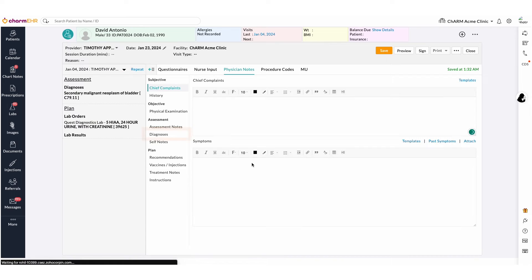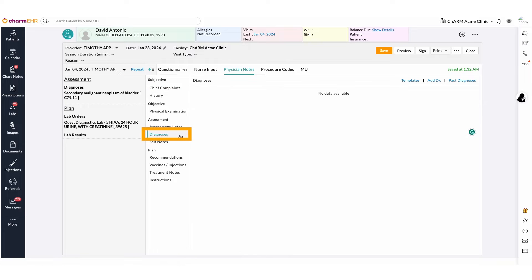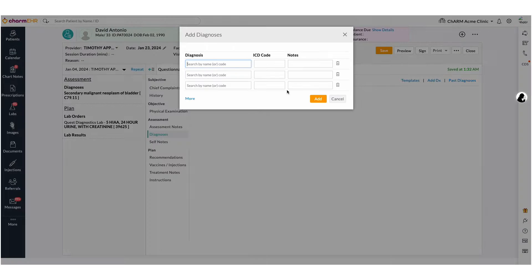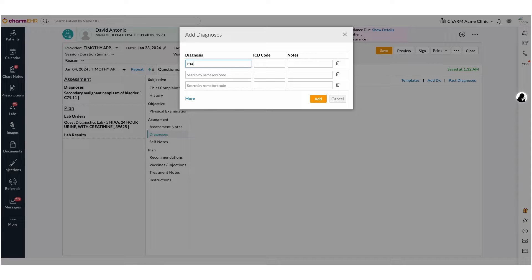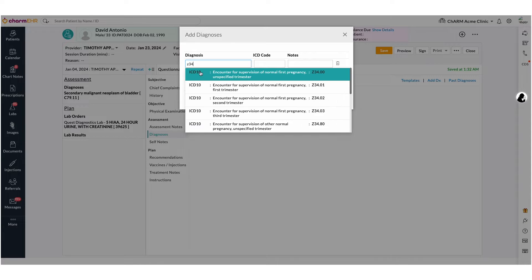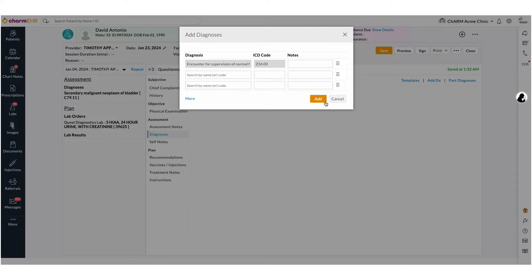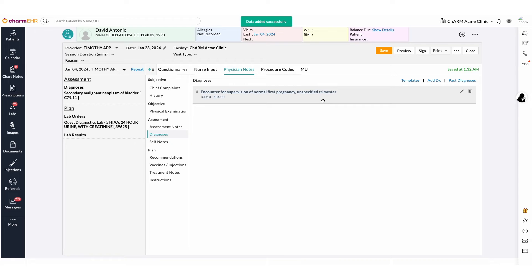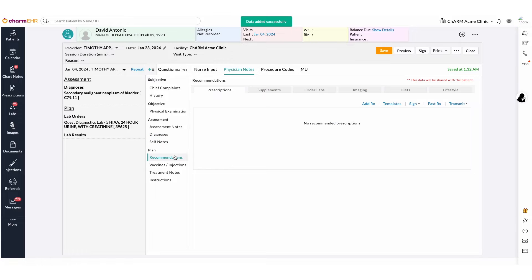In the Diagnosis section, add a diagnosis. And in the Recommendation section, select the Order Labs tab.